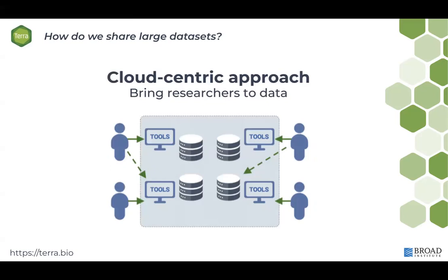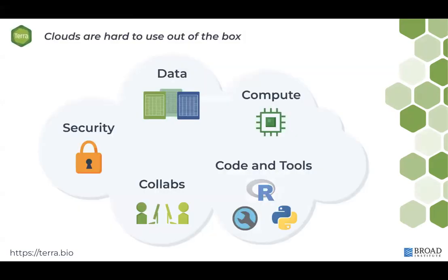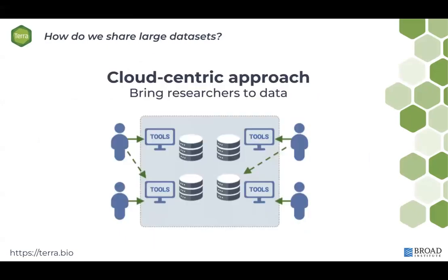In the cloud-based model, data rests in a central repository in the cloud where researchers access and analyze together in a virtual environment. With this new vision, you get cloud-based data storage, which is true, immediate data sharing.